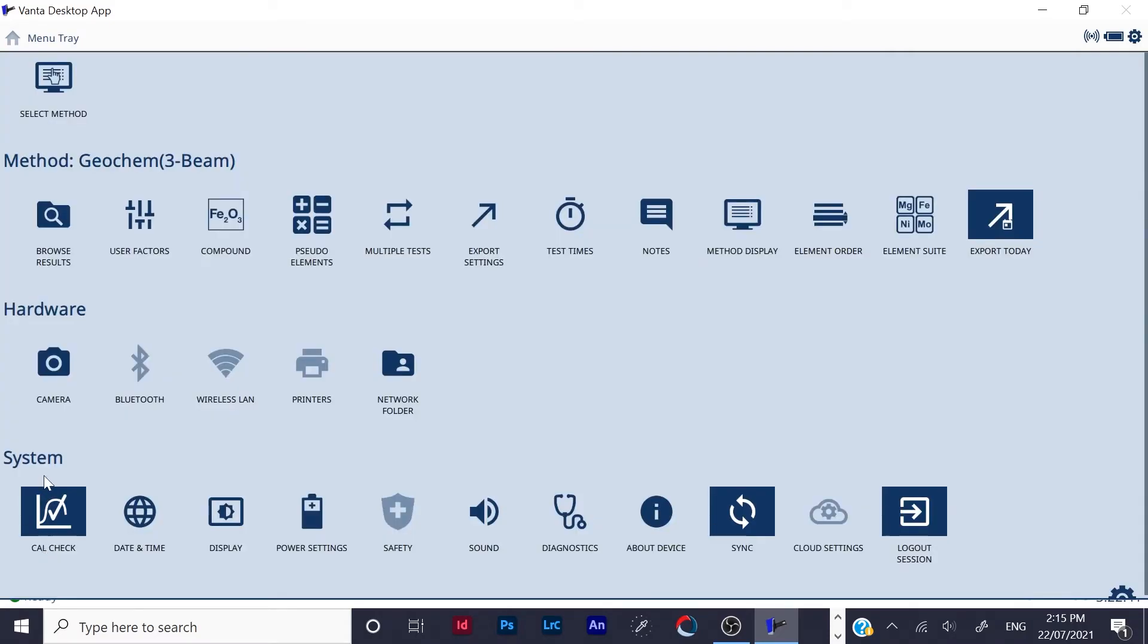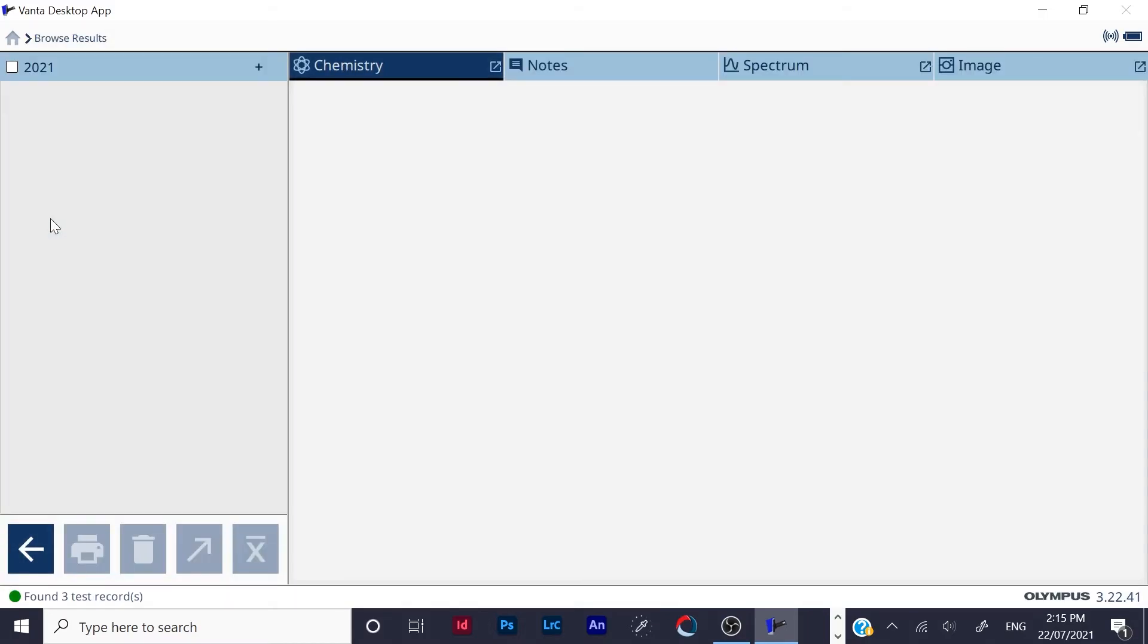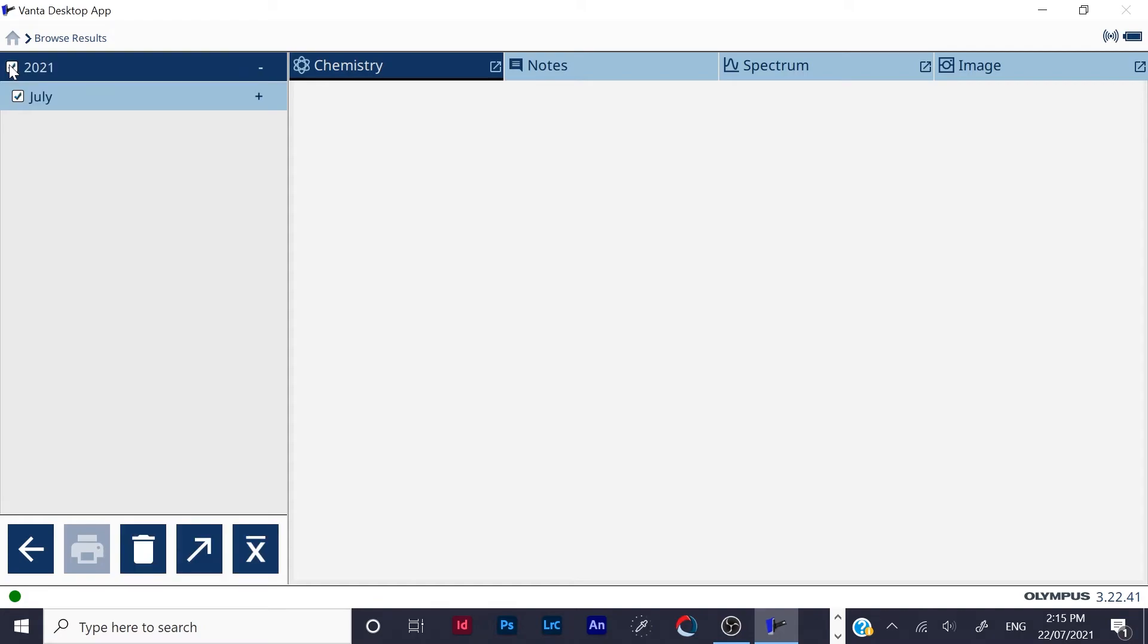Get back to the menu and you're going to go up to browse results. Open that up and click on this box here, and it'll show you all your results.